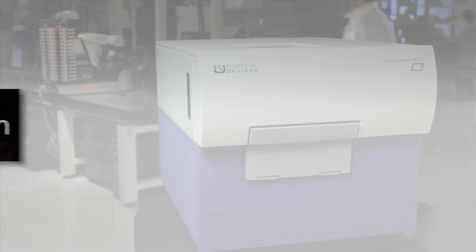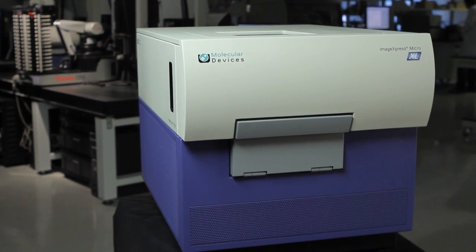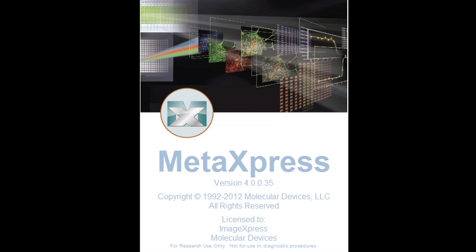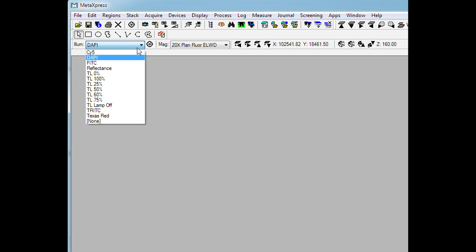The ImageExpress Micro system makes it easy to change filter sets and expand your imaging capabilities. First, select the configuration needed for your experiment and start MetaExpress software. Make sure that the filter rack is in its most accessible position by selecting the highest wavelength filter cube, usually Sci5.